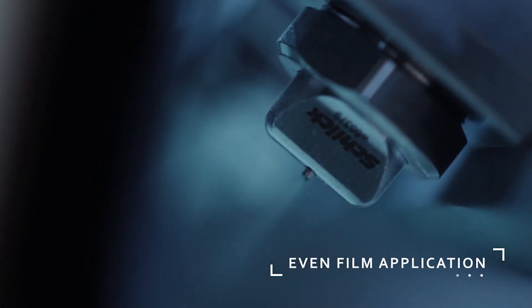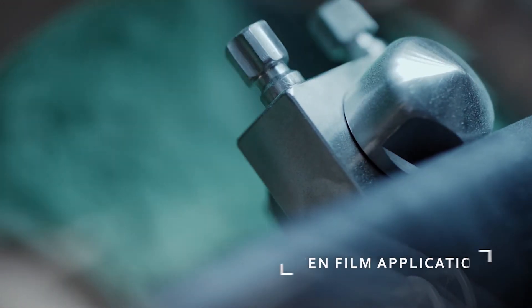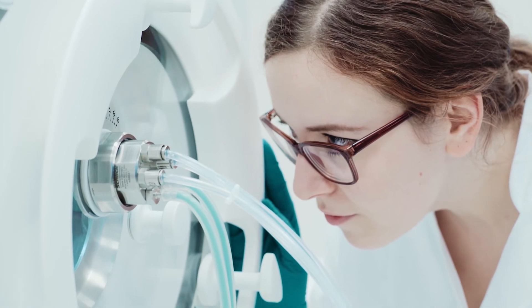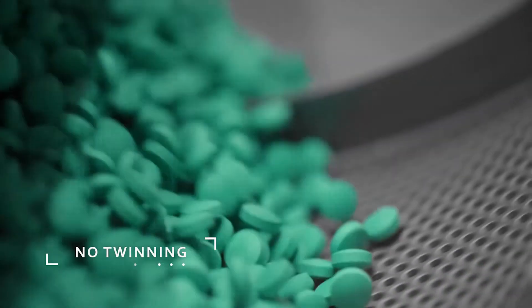In the LC Lab, four nano-nozzles meet a drum length of 330 millimeters. This ratio is unique among coders and results in an exceptionally fast film coating process.